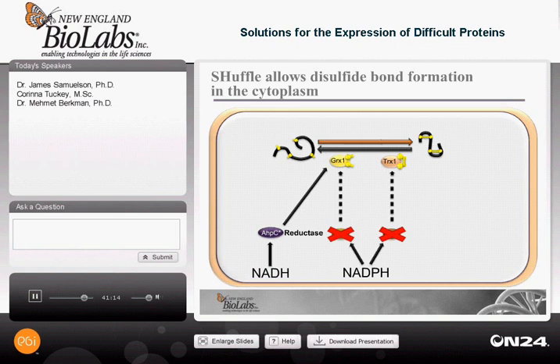But what we have additionally done is co-express at high levels the naturally periplasmic protein DsbC in the cytoplasm. This greatly increases the fidelity of the disulfide bond forming machinery, thus allowing for expression of multi-complex disulfide bonded proteins.